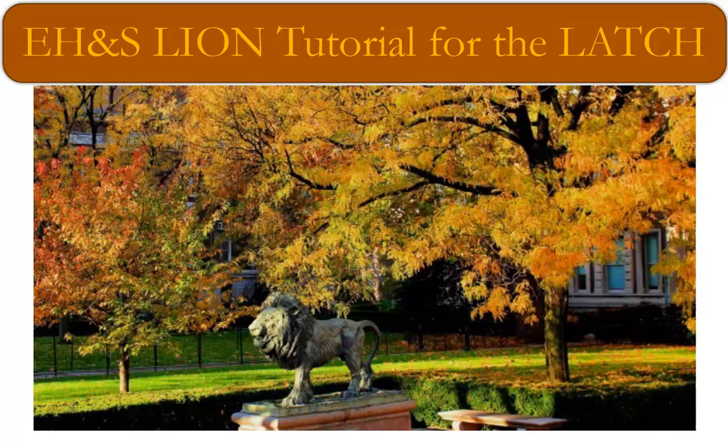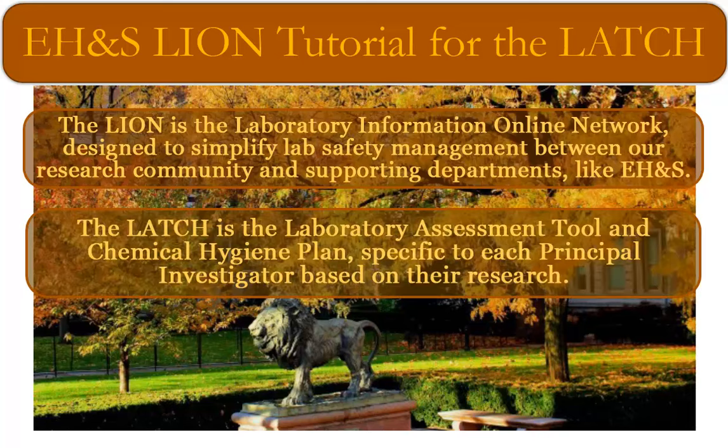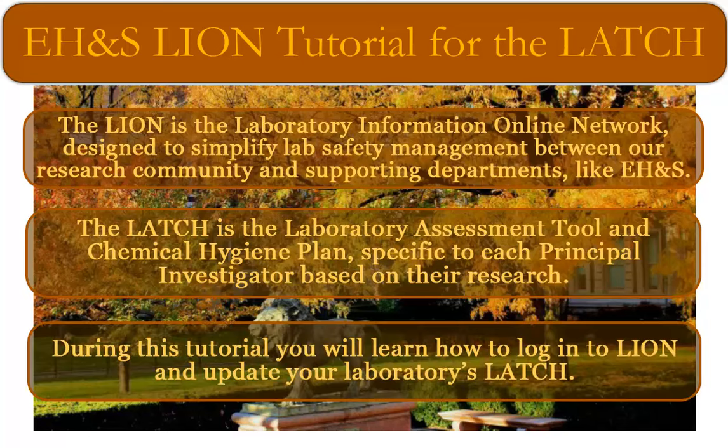We're happy to present our second tutorial about the LION. The LION is the Laboratory Information Online Network designed to simplify laboratory safety management between the research community and supporting departments, including EH&S. The LATCH is the laboratory assessment tool and chemical hygiene plan specific to each principal investigator based on their research. During this tutorial, you will learn how to log into the LION and update your laboratory's LATCH.